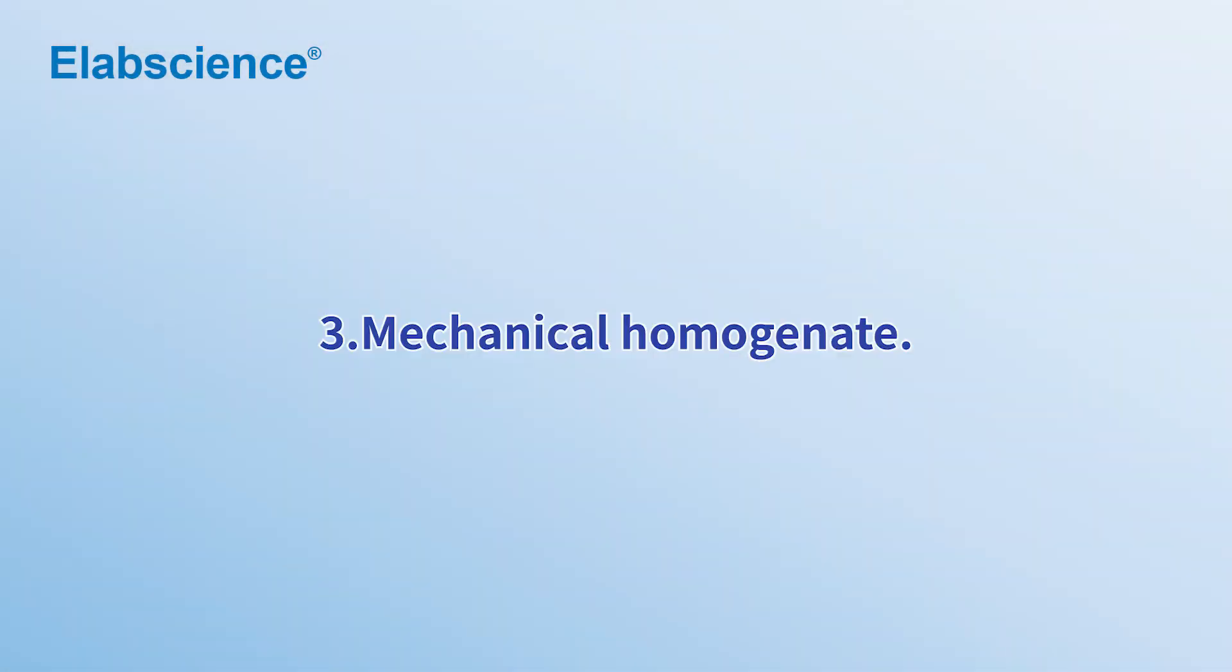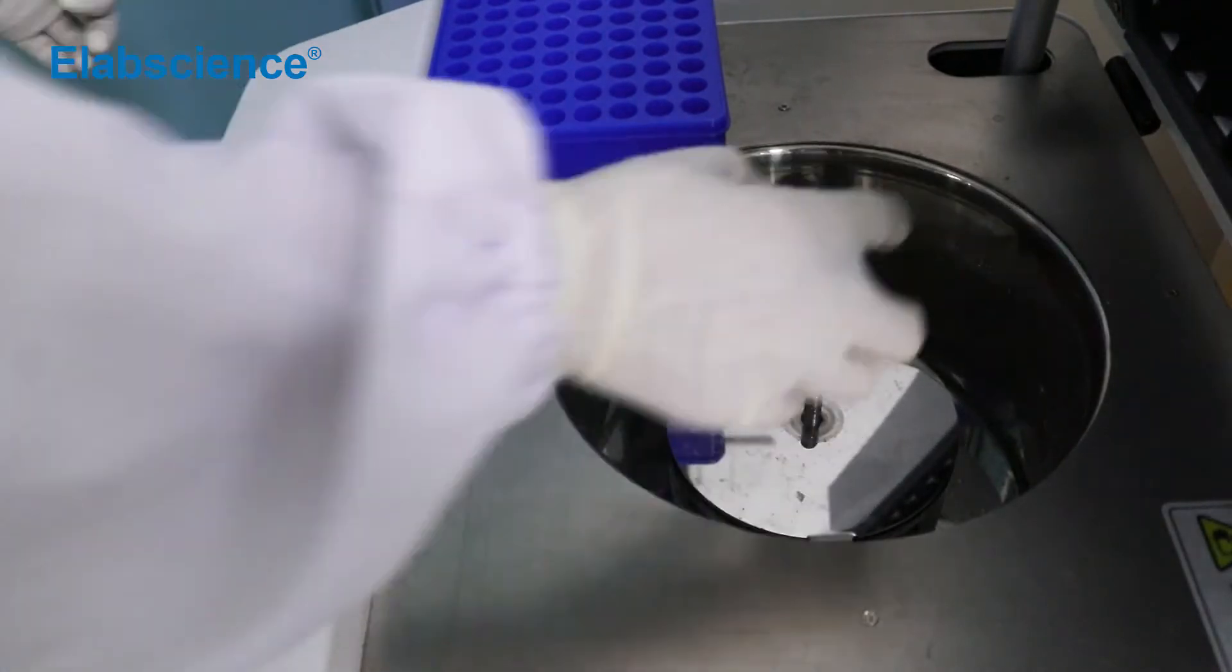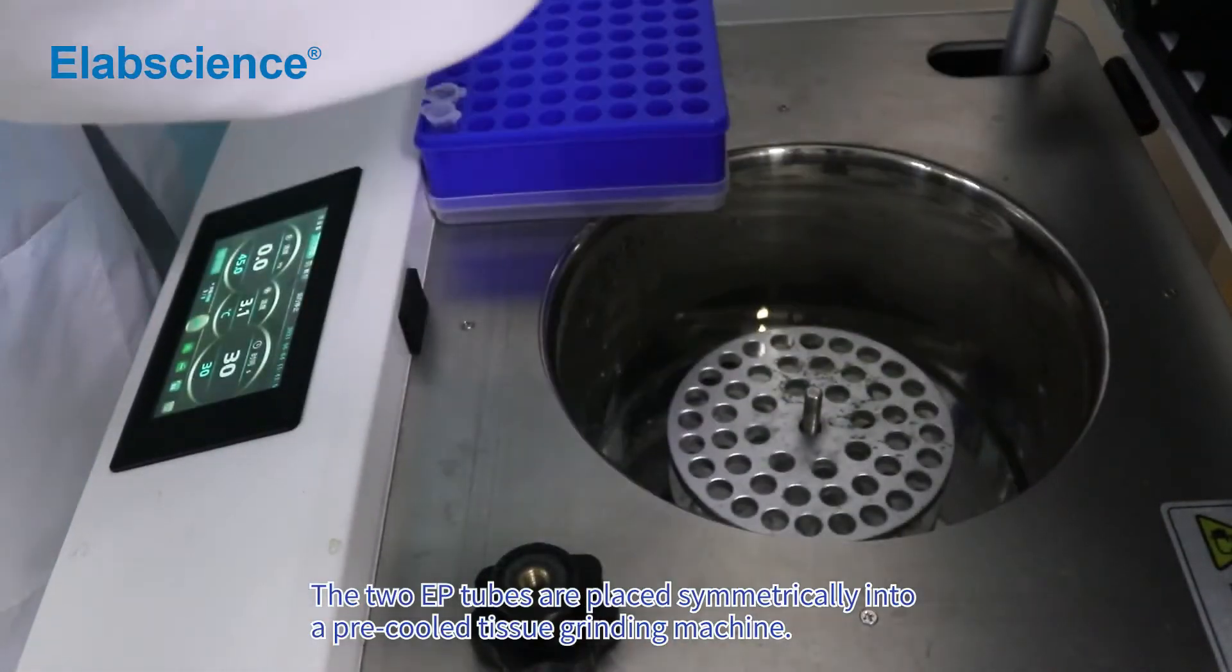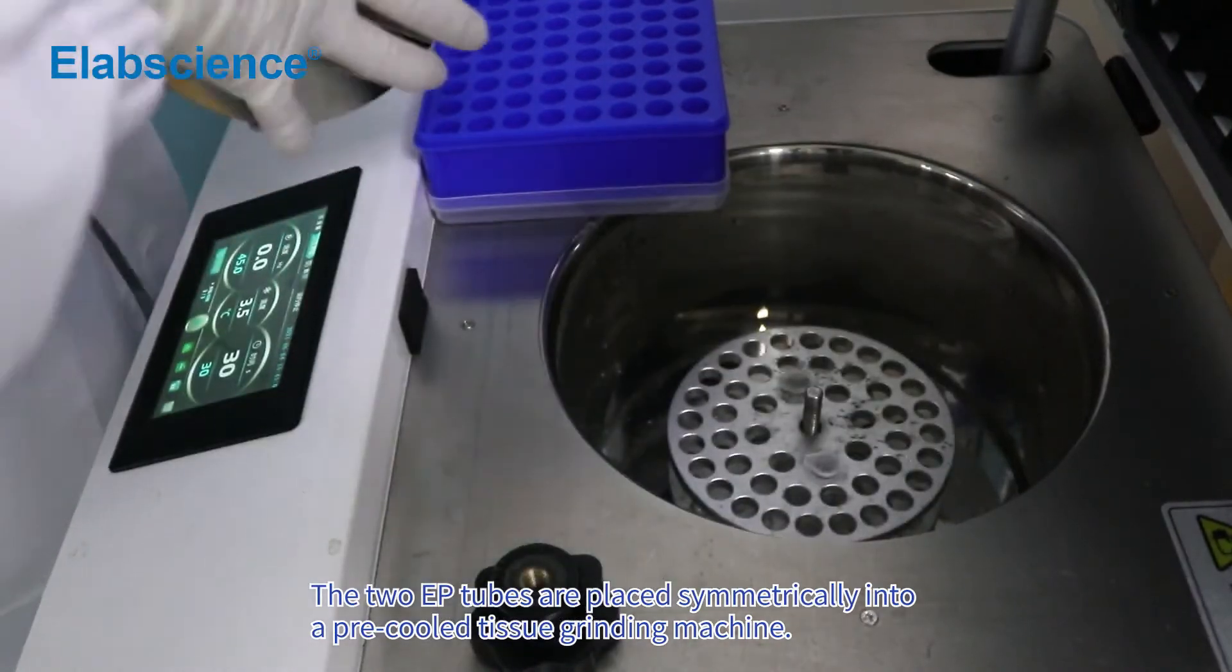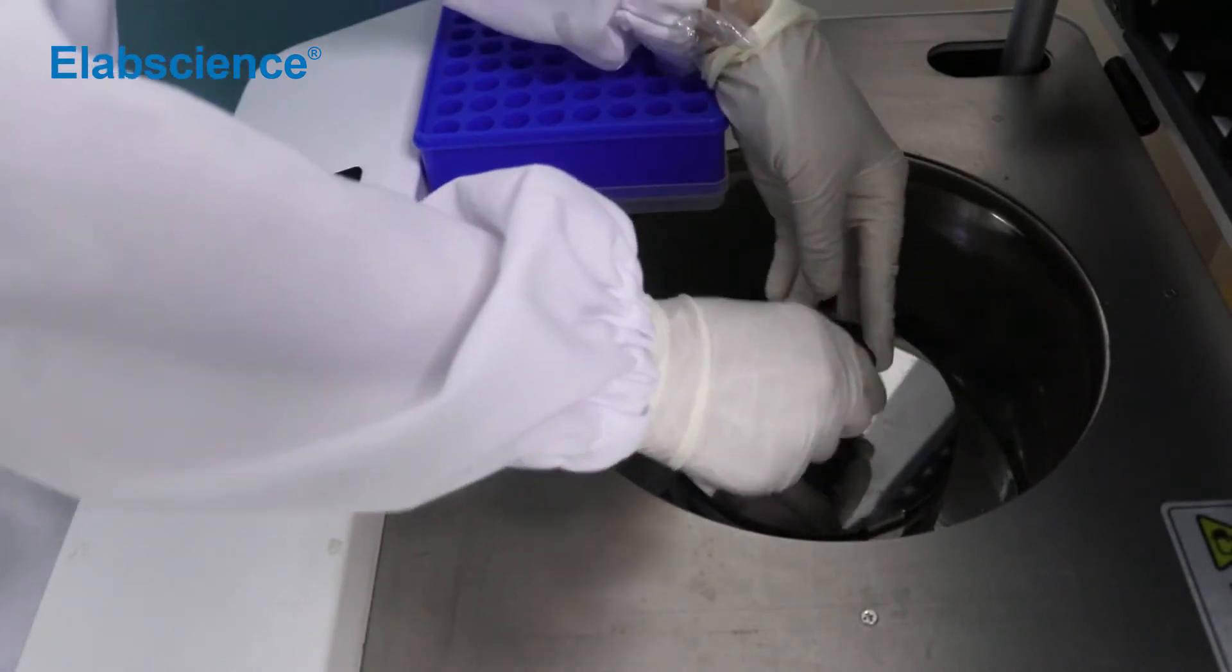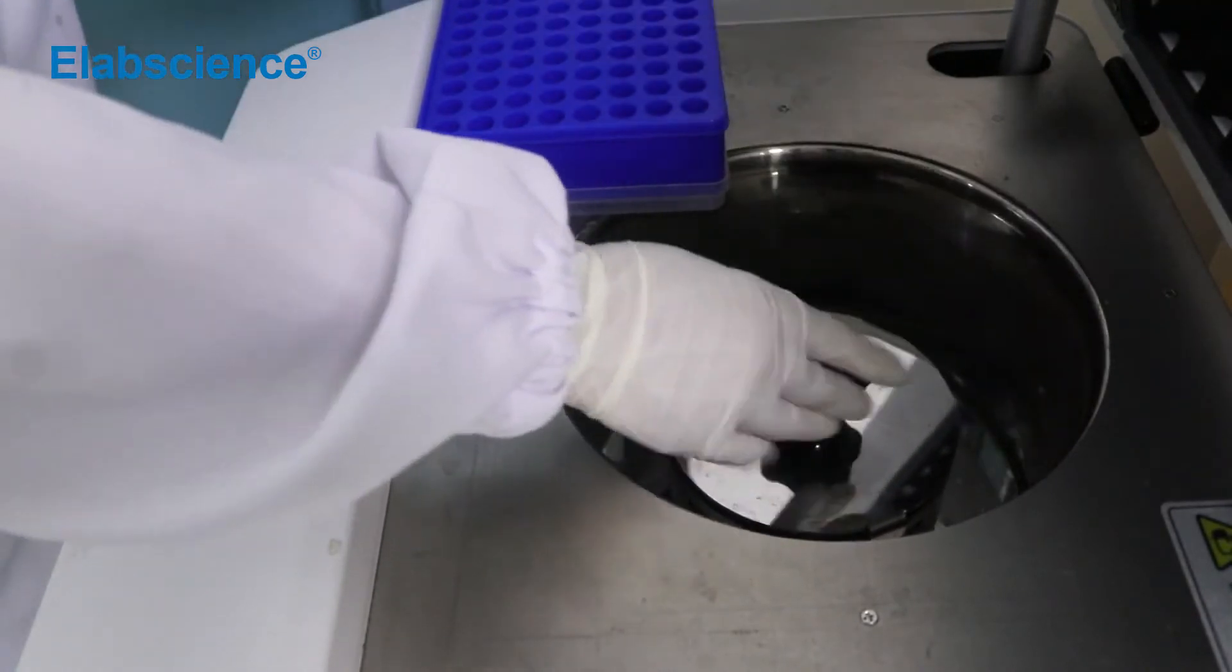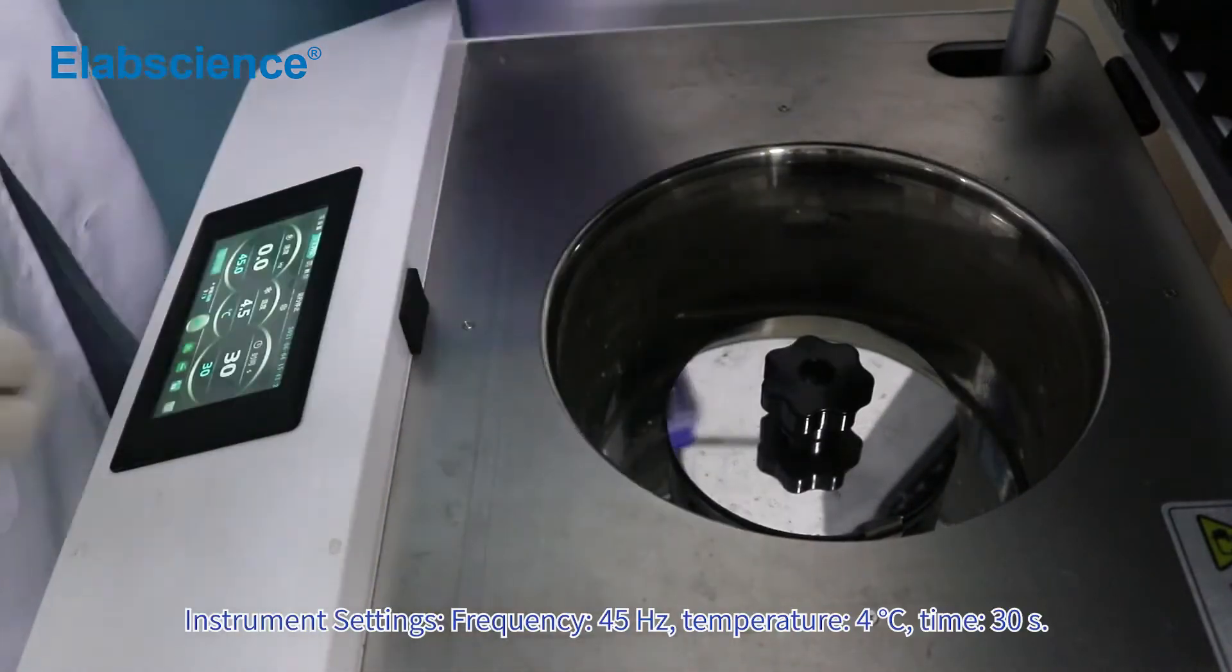Mechanical homogenate. The two EP tubes are placed symmetrically into a pre-cooled tissue grinding machine. Instrument settings.